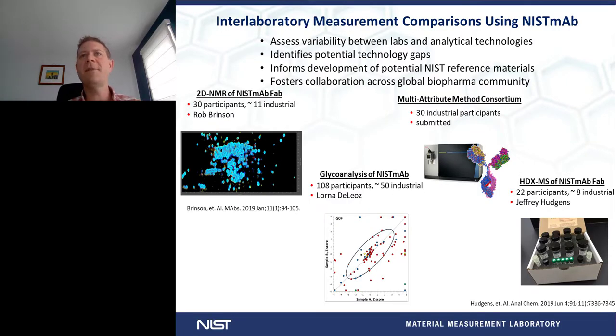So once we've had this material now publicly available, we now have initiated interlaboratory measurement comparisons. This is actually an extension also on the ACS books, where we've selected a number of emerging analytical techniques, and those that could sort of use an interlaboratory assessment of things like the potential sources of variability and precision amongst these individual assays, how these assays are actually being performed in the biopharmaceutical industry. So it could potentially identify places where additional development may be needed.